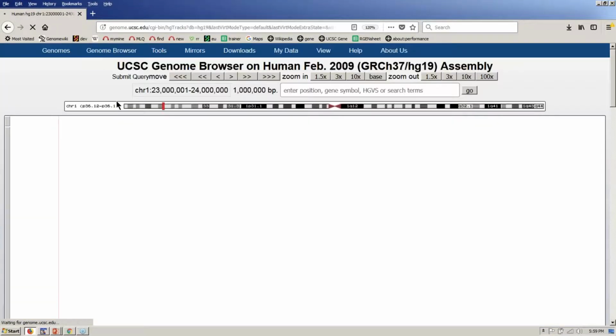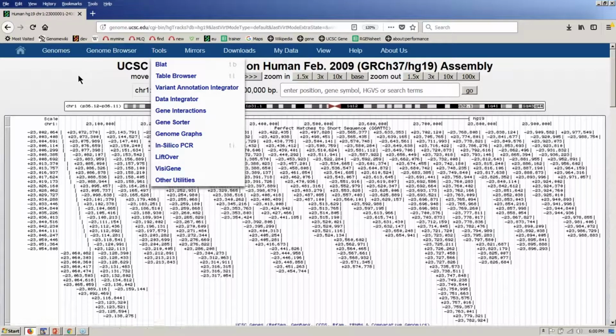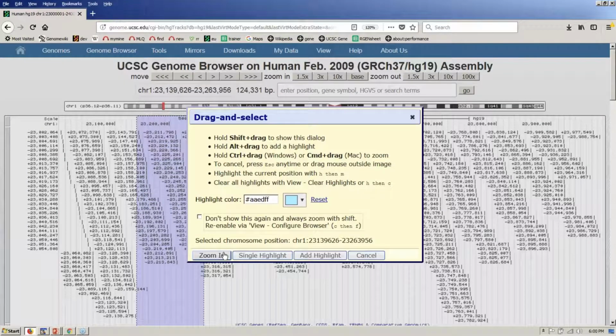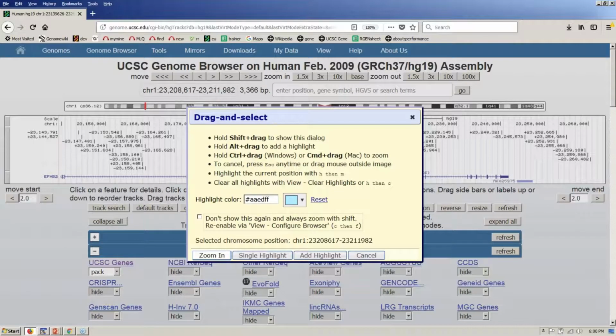This spans the gap between reading the sequence yourself and having a sequence that you can import into our BLAT tool, because BLAT doesn't start to work until you type in maybe 21 or 22 nucleotides. So here, each one of these individuals is a GGA-TCC region, and if I scroll over there, you can see more closely where all of these individual 6-base spots are. I'm going to zoom in one more time, and at a certain resolution you start to see the nucleotides.